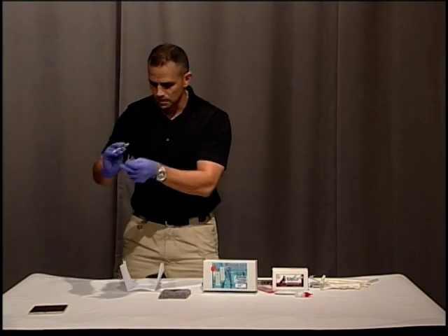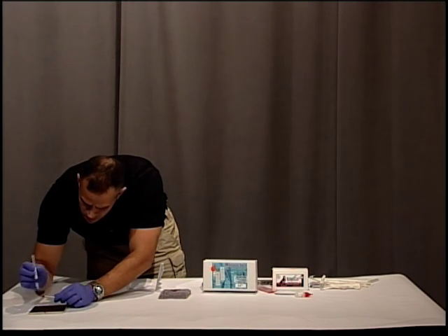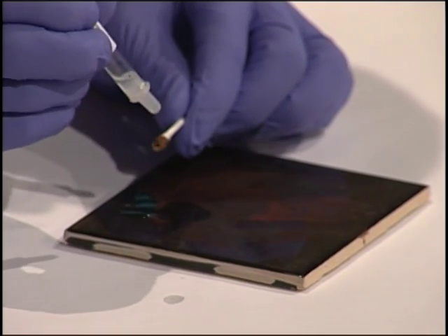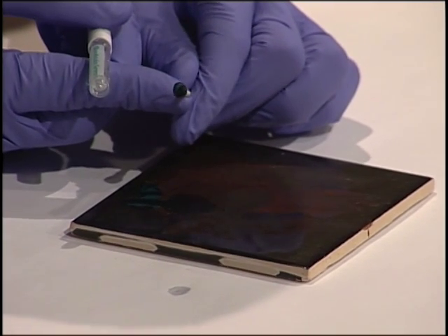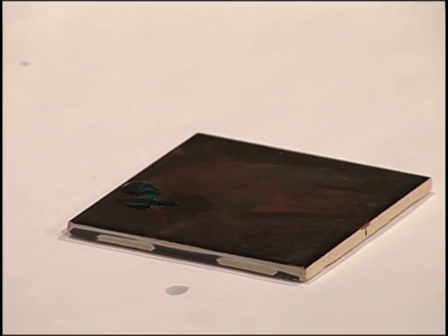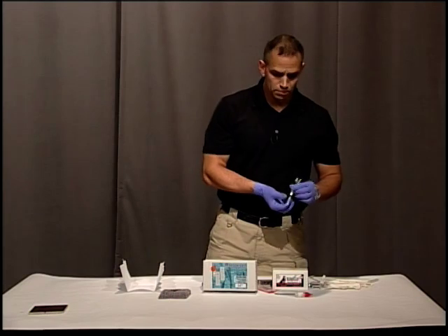I'm going to drip this on my stain. You can see that it's turning green, which would be a preliminary test that this is blood. Again, we don't know if this is animal blood or human blood.